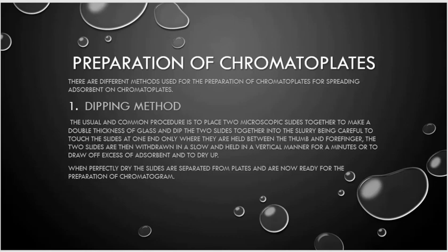The two slides are then withdrawn slowly and held in a vertical manner for a minute to drain the excess adsorbent and to dry.